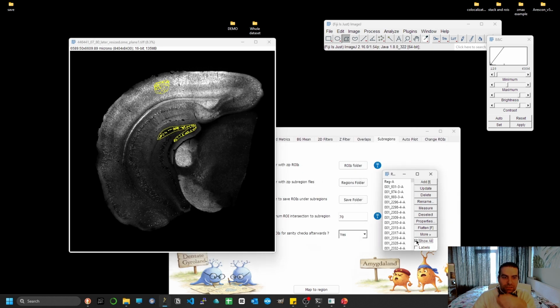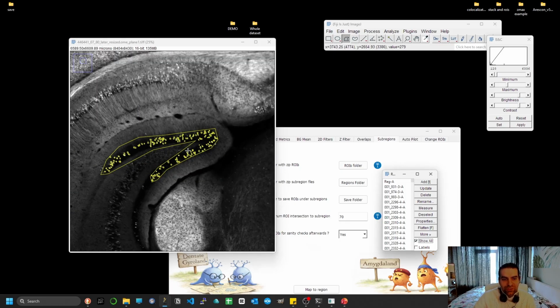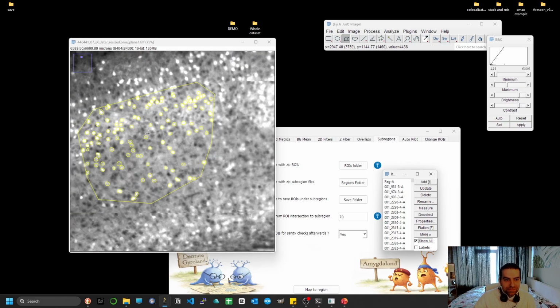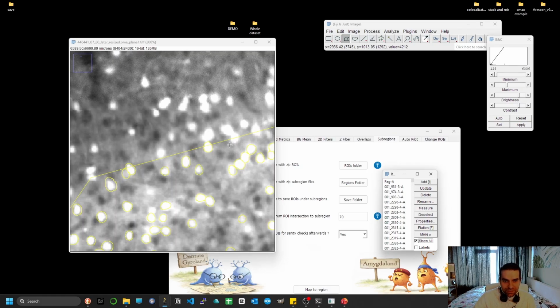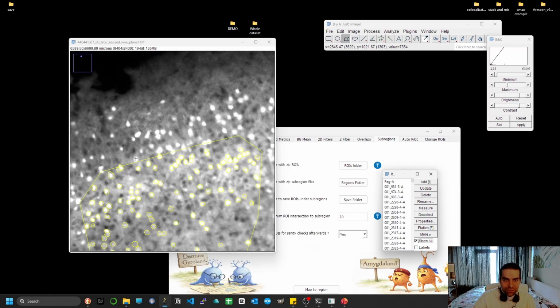Here. So you can see both the designated region and all the regions of interest that are inside there. And these are some occasions that I mentioned before, right? So this is less than 51, so it's out. Likewise for this one.